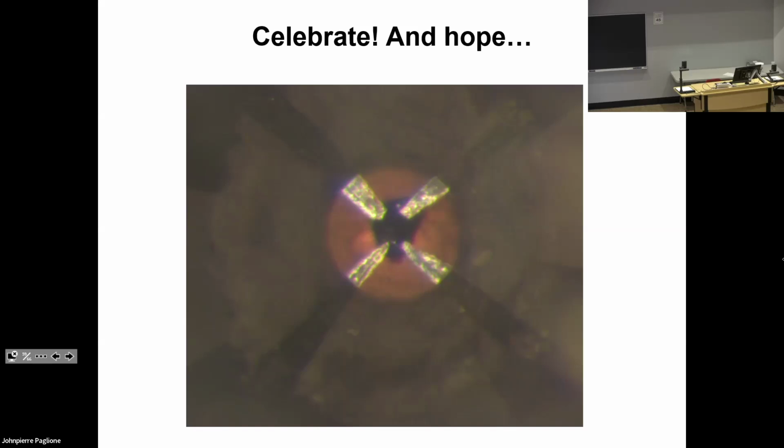What size of ruby do you use? Oh, great question too. So these ruby spheres, I don't know if anyone else has gotten them from anywhere else besides, I get them from Betsa, but maybe some other people make them, but the Betsa ones are really, really nice, great fluorescence. They do have some distribution of size that they come with. Once you buy some from them, it is kind of expensive, but you'll probably never need it again in your life because you get millions and millions of ruby spheres.